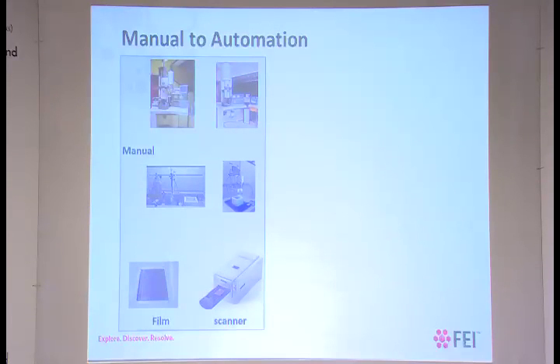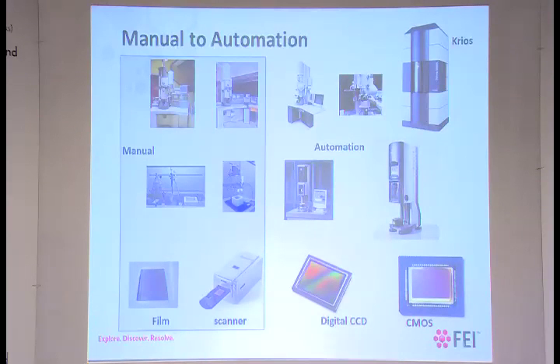But nowadays, 10, 15 years later, we have more automated microscopes, plunging devices, and so forth. So our microscopes are now more automated in terms of the software we use. We can now control the electron beam quite precisely, so we have a lot of flexibility in what we can do with it. For example, we can store hundreds of alignments if we need to, and load them up whenever we deem fit. And that's very important for automation.